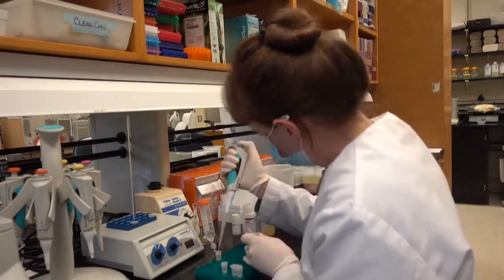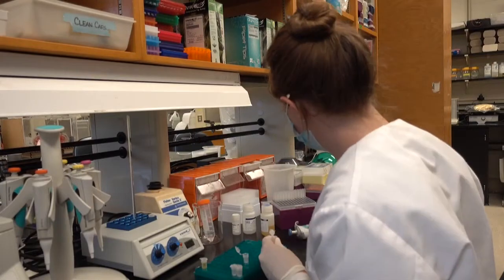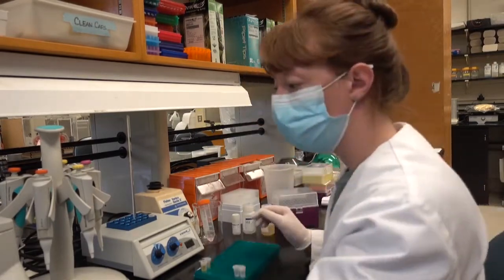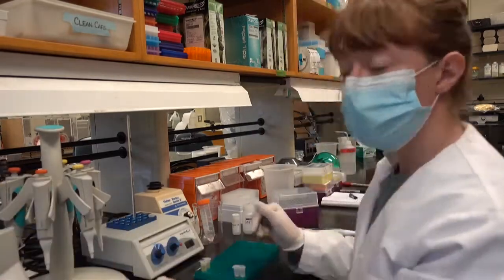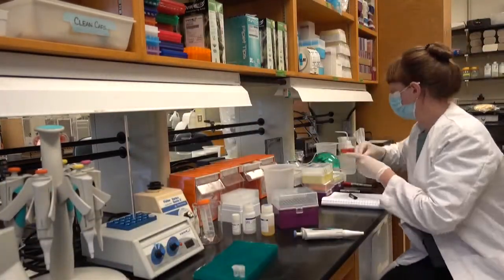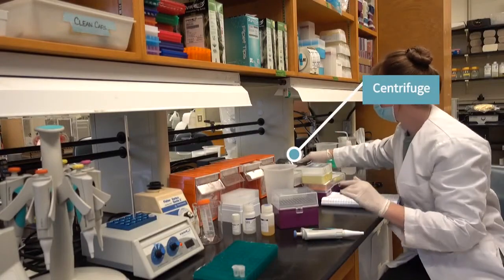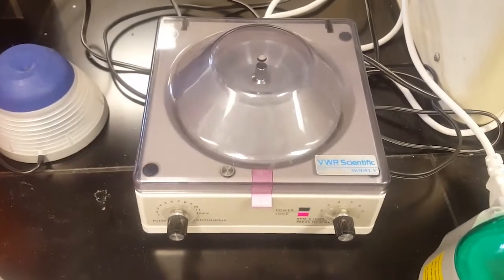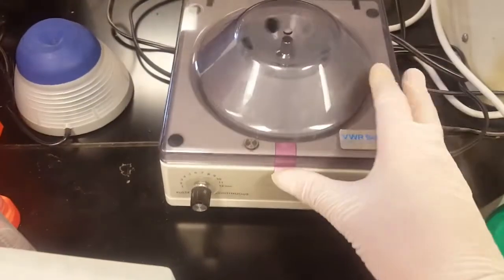I'm adding my sample to a new tube that contains a filter in the center, and the DNA binds to this filter, which allows us to wash all the contaminants away from the DNA. And to do this, we use another machine called a centrifuge. So we can add the tubes into this machine, and it spins it very quickly, which pushes the liquid down into the bottom.